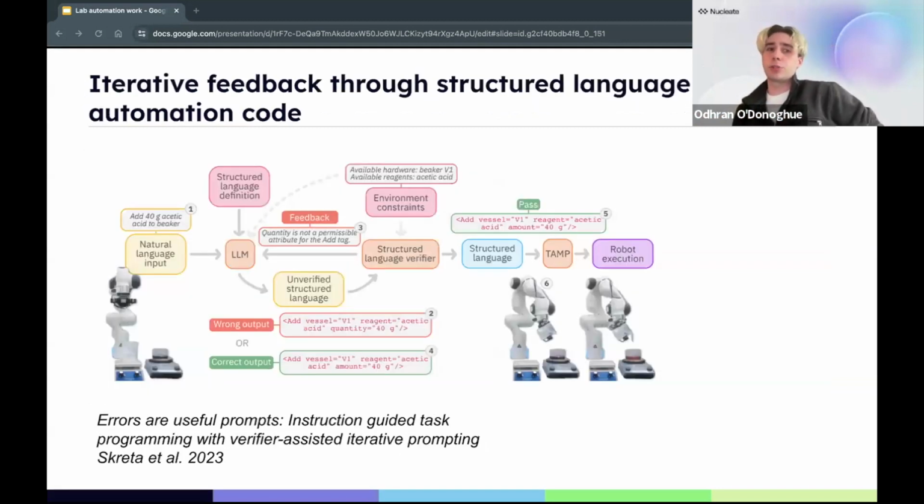People are doing things like iterative feedback. I mentioned the Matter Lab before. This is another example of research that they're doing right now, where they are defining a pseudo language for describing all of chemistry and getting robots to write in the pseudo language. Whenever it makes an error, you can kind of see ideas of errors and feedback.